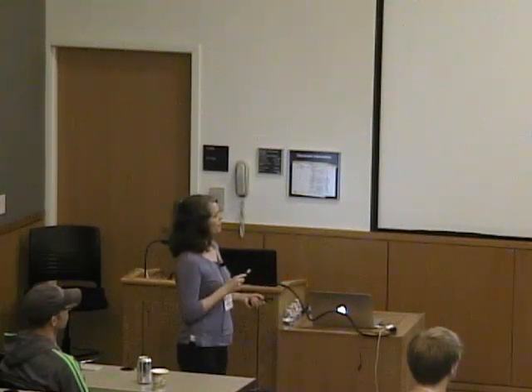All right, so next step, going to look a little bit at relaxation mechanisms in NMR before we get to paramagnetic samples so that we can understand the fundamentals of that. I already showed you how, when we're collecting our signal, our sample magnetization is relaxing back to equilibrium after being tilted down into the XY plane. So that's our observation time when that's relaxing. And as that relaxation time changes, our line width changes. Again, I mentioned that we're assuming T1 equals T2, so I'm just going to say T1 or relaxation time.